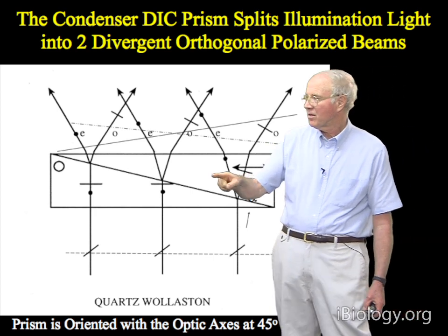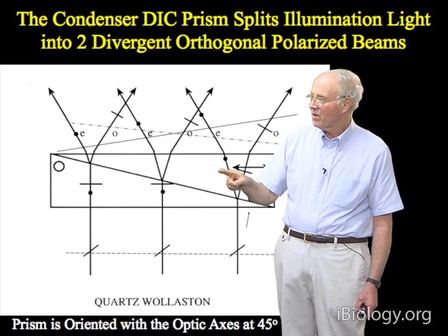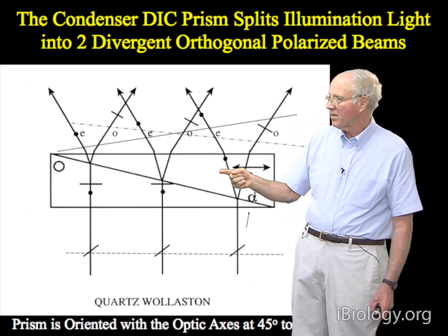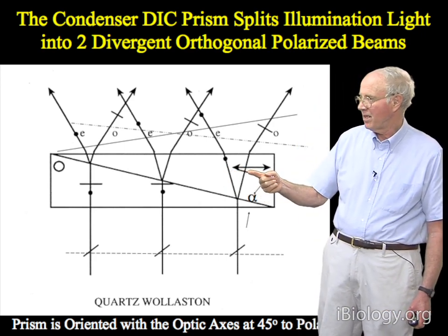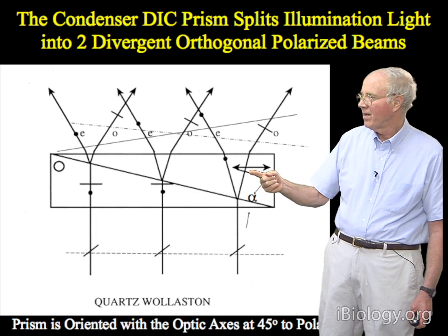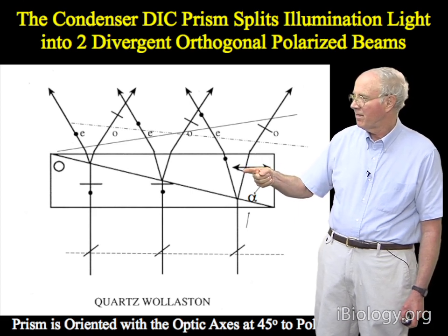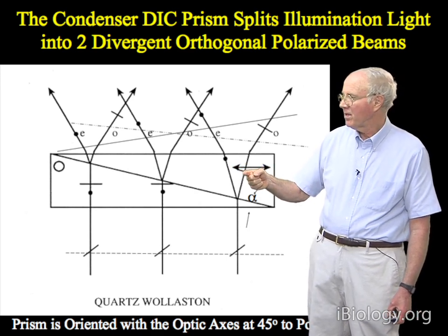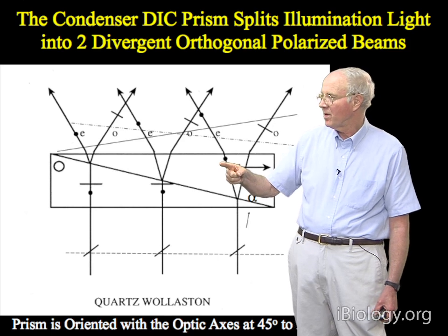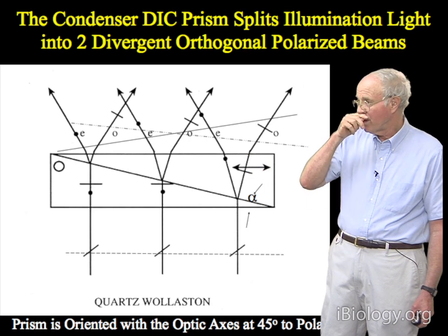And these two wedges are cut so that they're what's called the optic axis of the crystal, and in the case of quartz, it's the axis that has the extraordinary refractive index, and has an electric field vibration in the direction of this axis, and it's a larger value for quartz, compared to the one that's perpendicular to it, which is shown here by a dot, which would be called the ordinary ray for quartz.